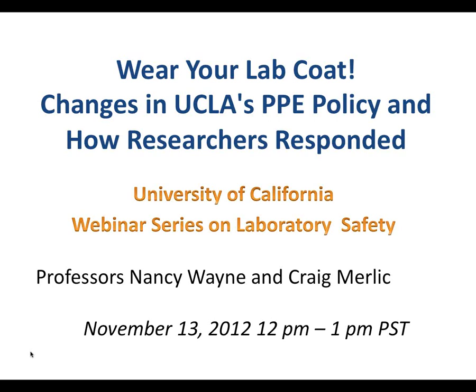Okay. A couple other questions came up about students. Let me combine a couple of these. What about students who are doing research for credits? Are they included in your policy? And what about students in laboratory classes? Any undergraduate students doing undergraduate research in research labs are held to the same standards. So all the research labs are covered by these policies. And it's true for volunteers, high school students.